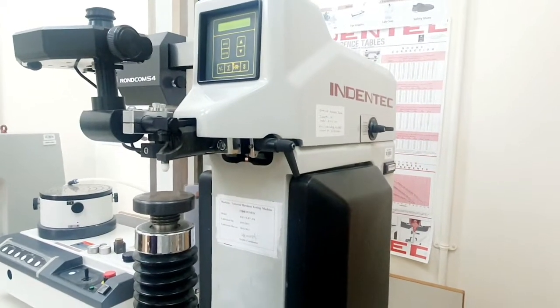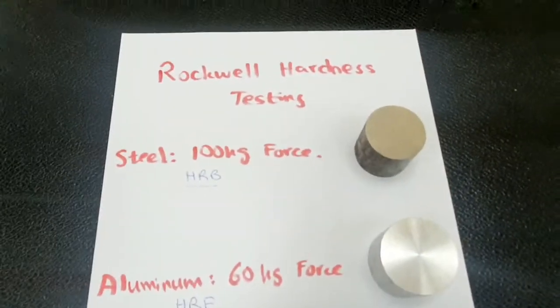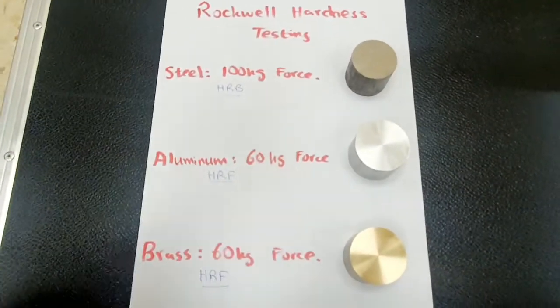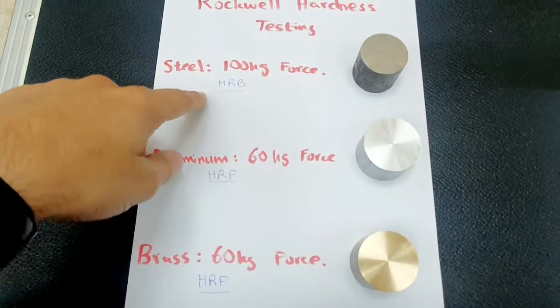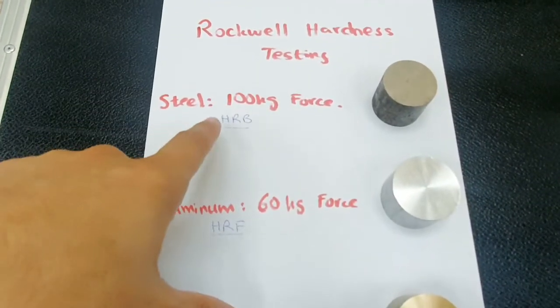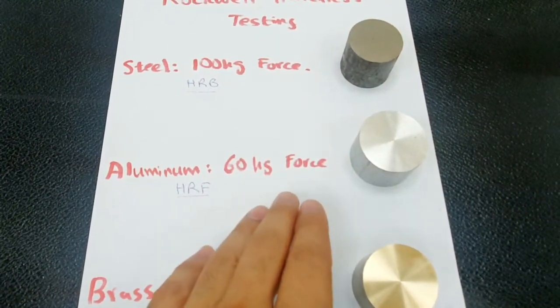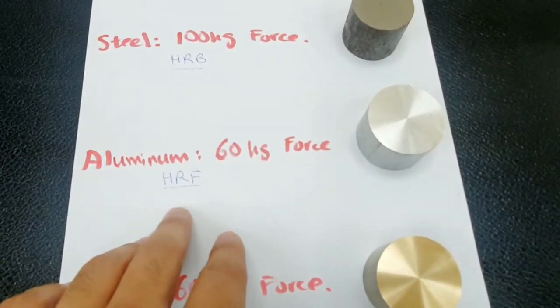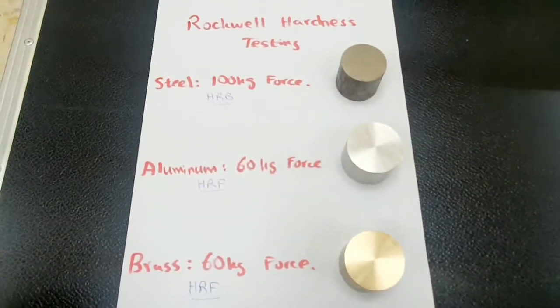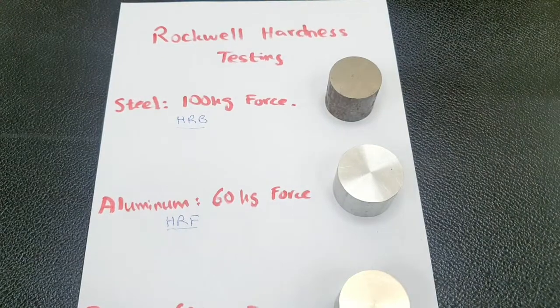We will test the same three samples. The samples we are going to test today in Rockwell hardness testing are steel, aluminum, and brass. For steel, which is a ferrous material, the load we apply is 100 kilogram-force using the 1/16 indenter, which is the HRB scale. For aluminum, which is non-ferrous, we use 60 kilogram-force using the same 1/16 indenter — this is called the HRF scale. For brass we also use 60 kilogram-force, which is again HRF scale. For all three samples we will take two point readings to make sure we have the right value.